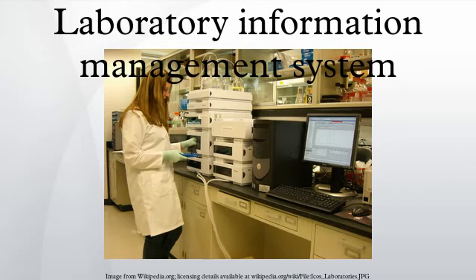Some LIMS vendors are beginning to rent hosted, thin client solutions as software as a service. These solutions tend to be less configurable than on-premise solutions and are therefore considered for less demanding implementations such as laboratories with few users and limited sample processing volumes.